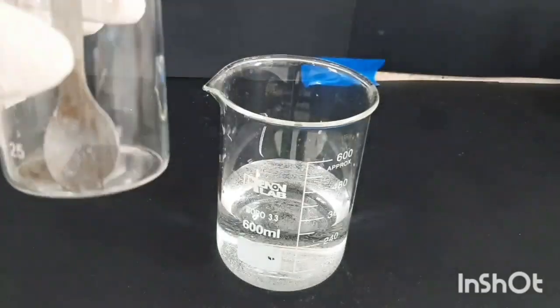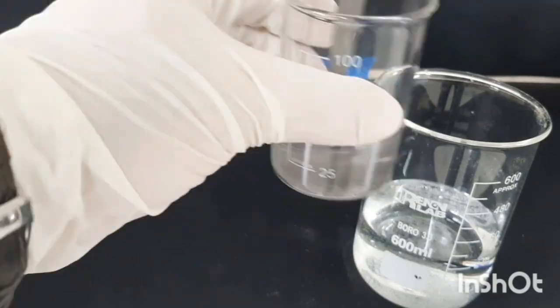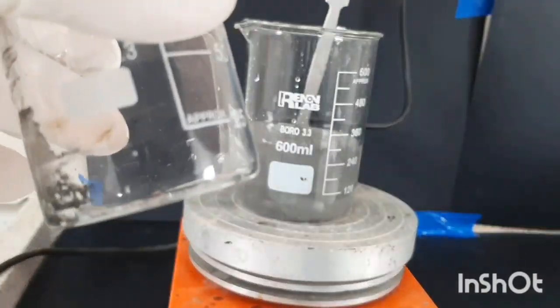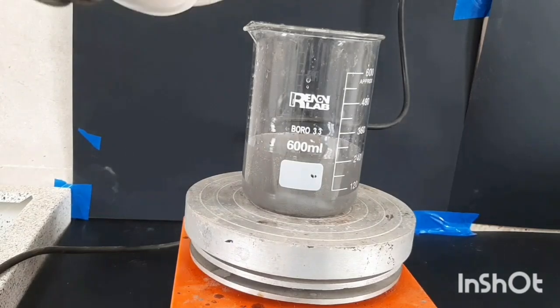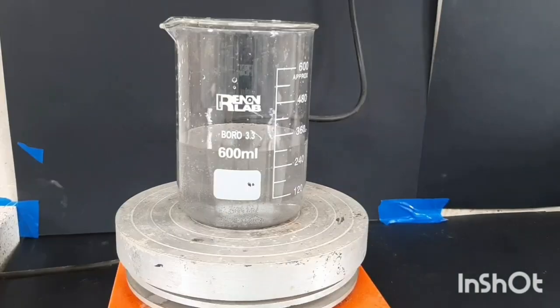So now I'm gonna add the tungsten powder to the hydrogen peroxide and start heating. By heating the mixture, tungsten will form a complex called tungstic acid, which is actually the catalyst of the reaction. So just a little bit of back and forth to get all of the tungsten powder out of the beaker and continue with the heating.